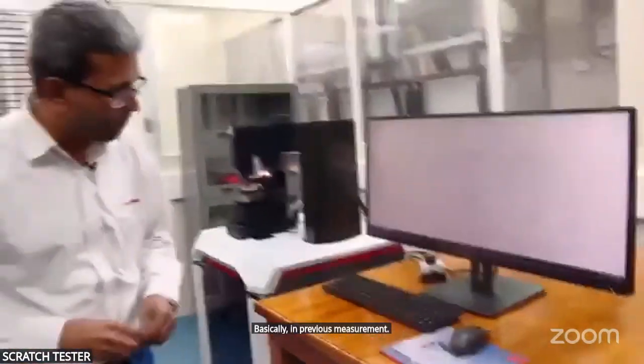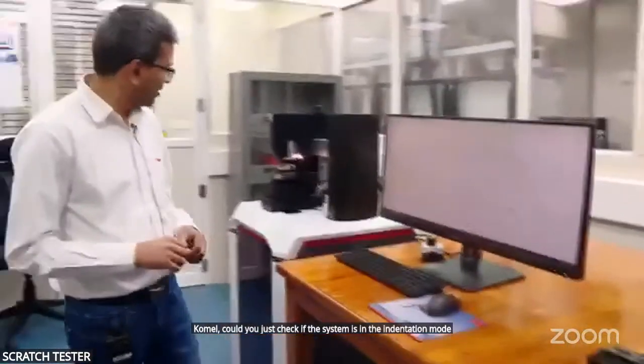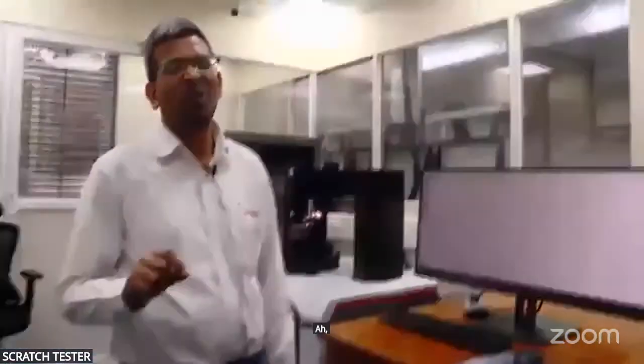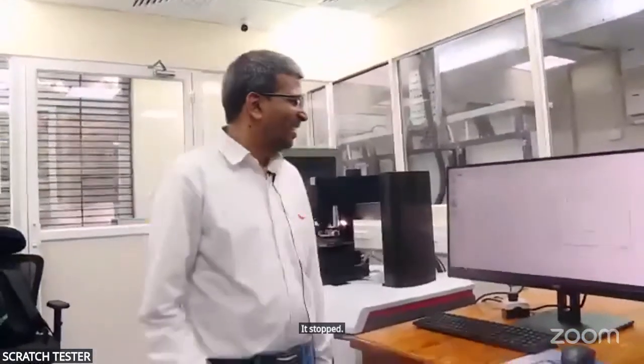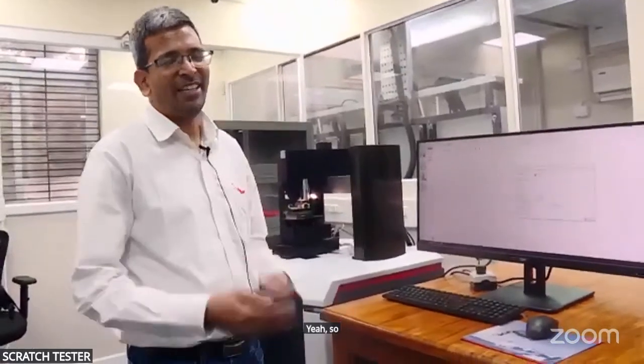Komel, could you just check if the system is in the indentation mode for ARM? This is not in scratch mode? It's indentation. What actually happened is we had a depth control and I didn't check the value, it was too low. It was like 0.1 micron. So the moment it reached that, it stopped. Now you can use load control. Yes, so now I switched to load control.